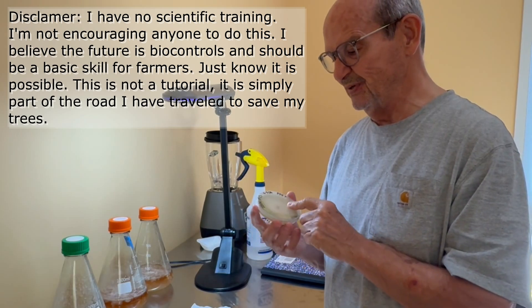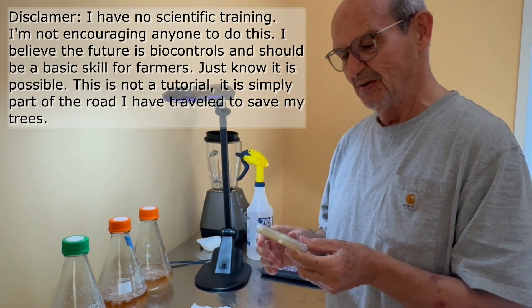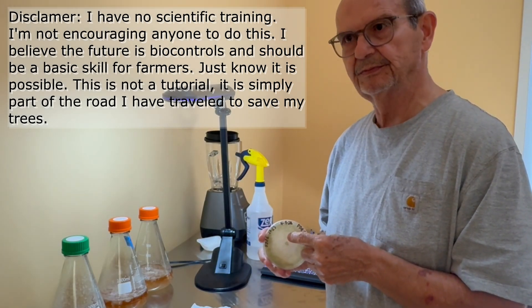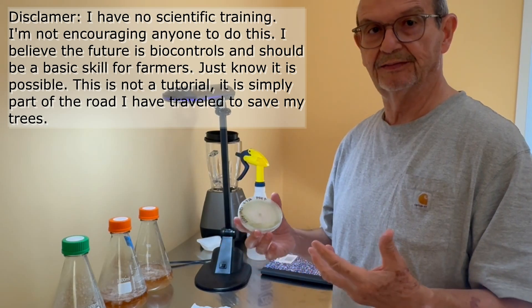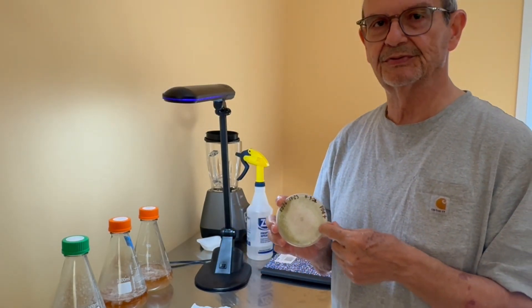Today I want to take this Trichoderma that I have in this plate, which came from a tree in my grove. We know it's endophytic and we know this particular tree handles some lower conditions relatively well. So it is a very important Trichoderma for me to preserve.